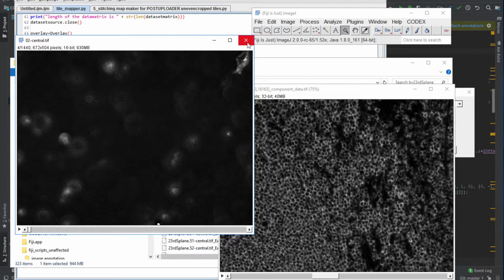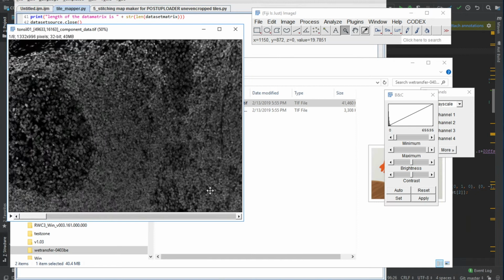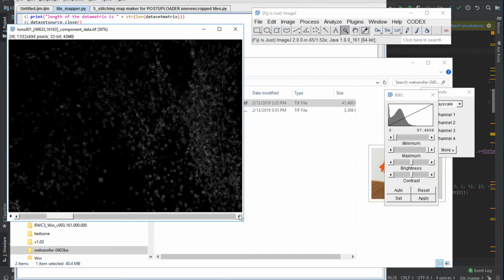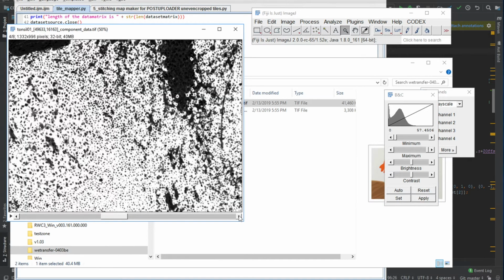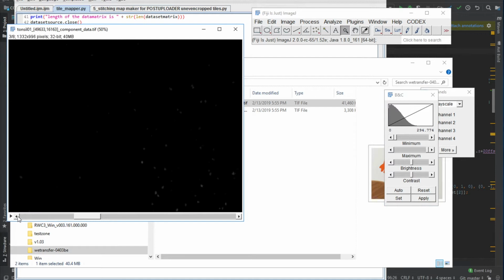So to convert your file into the same format, I will press Shift-C and I will reset each histogram to its maximum, right? Okay, here's CD45, Shift-C, I'm resetting the histogram so that Shift-C during conversion, everything is done properly.